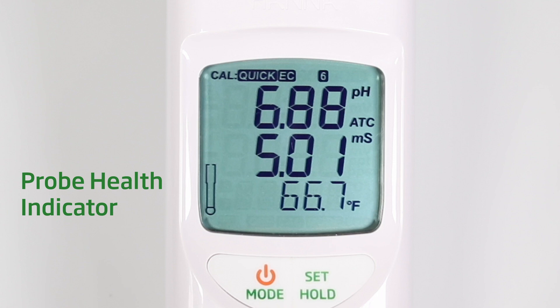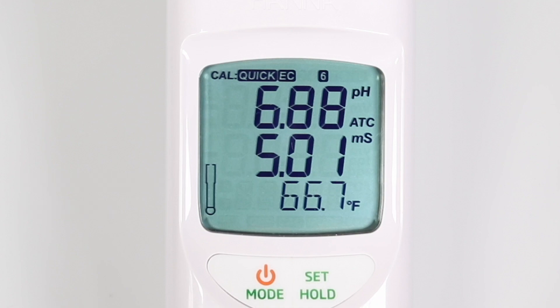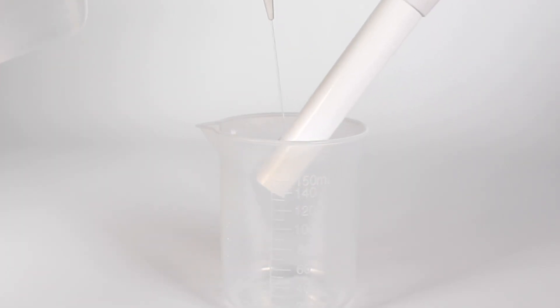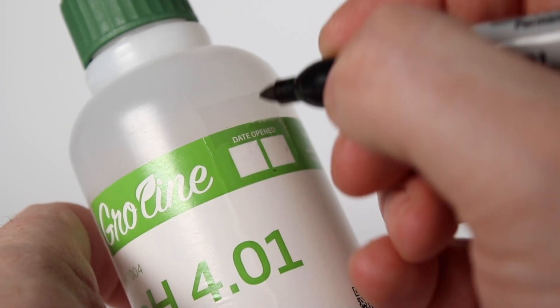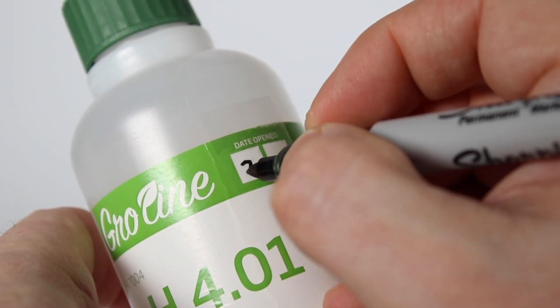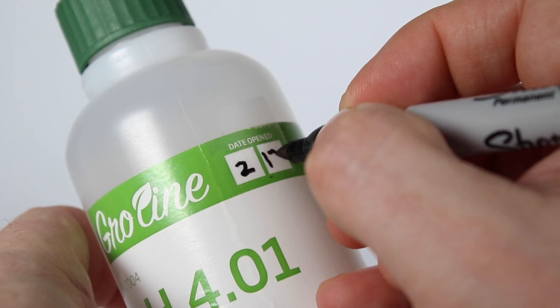Note that probe health is not displayed in real time — it only represents the health of the probe at the time of calibration. Before you begin, make sure your sensing glass has been hydrated in storage solution for at least one hour and has been rinsed for 10 seconds prior to attempting a calibration. Make sure your solutions are fresh. When opening a bottle for the first time, write today's date on it so you don't use it after it has been opened longer than six months.